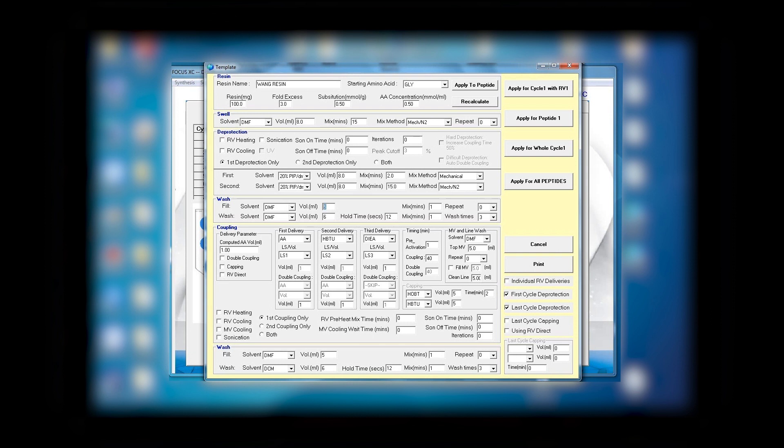In washing you have washing with DMF, which again we can change from 5 milliliter to 8 milliliter, with mixing one time and zero time repeating, but you can repeat as many times as you wish. The wash solvent is DMF, 6 milliliter, and hold time of 12 seconds.